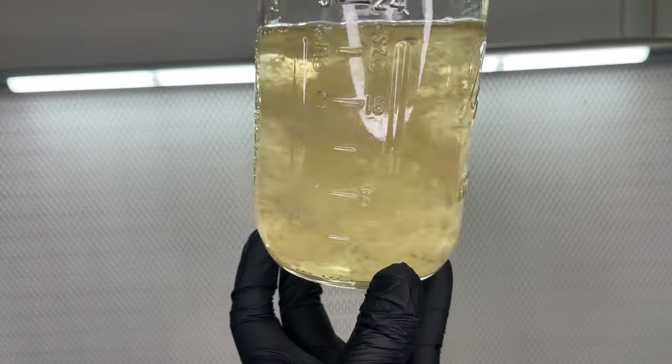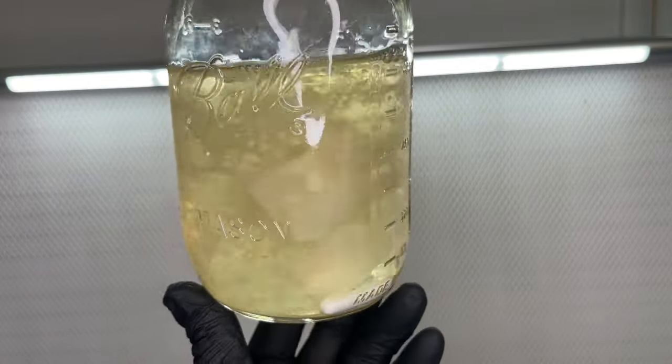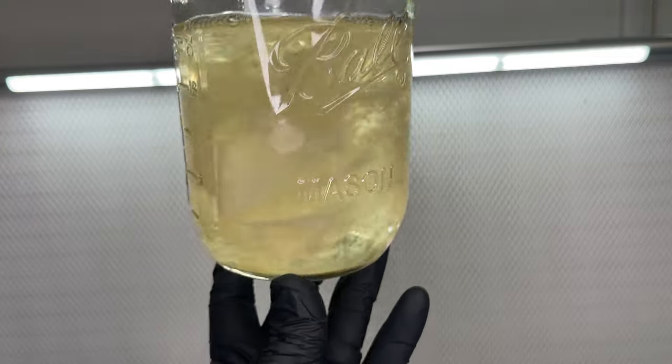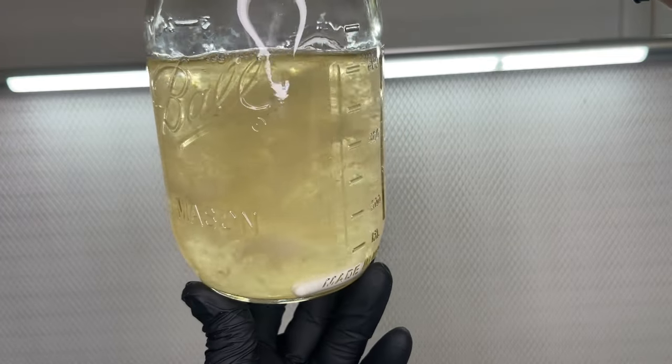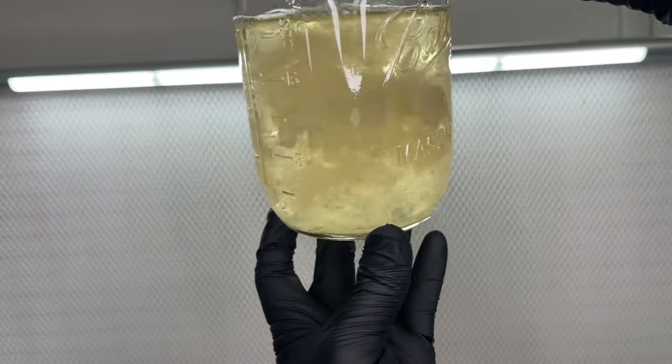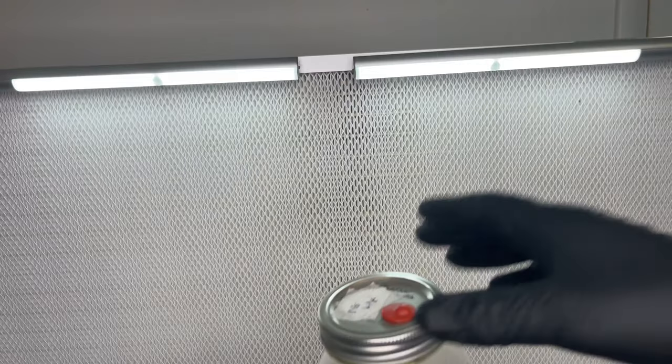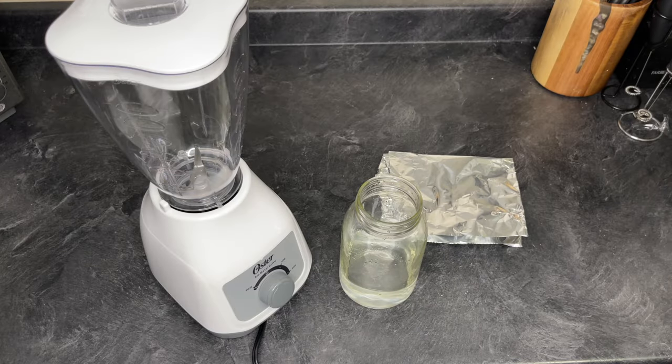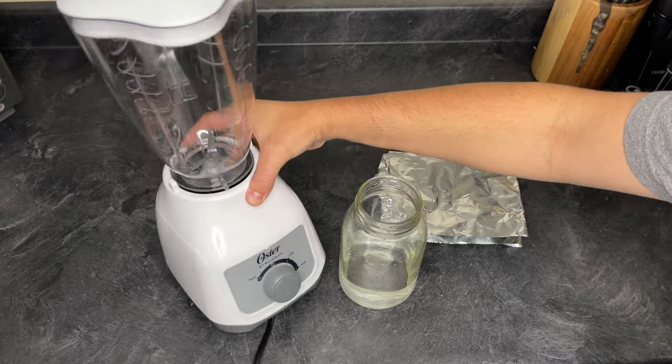Sometimes the mycelium in a liquid culture jar will grow too thick and we won't be able to make any syringes with it because it will just clog. The magnetic stir bar just isn't good enough to break up those large chunks of mycelium.